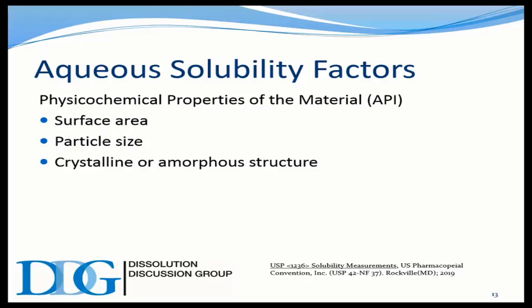That's a good point. I think that's all part of the big thrust into quality by design now as well, right? Exactly. Yeah, to understand what they call a critical quality attribute. In this case, it would be the distribution of multiple size particles. And that has a huge impact on batch-to-batch variation. Once this drug goes to manufacture, effectively you could have a drug that is going to fail some type of dissolution test because of it. True.